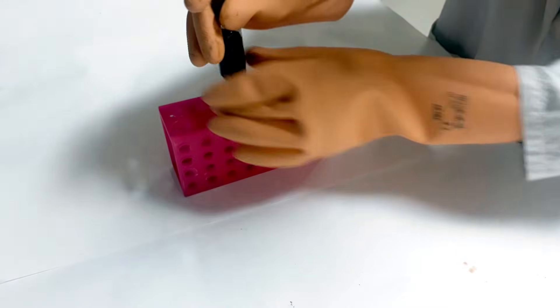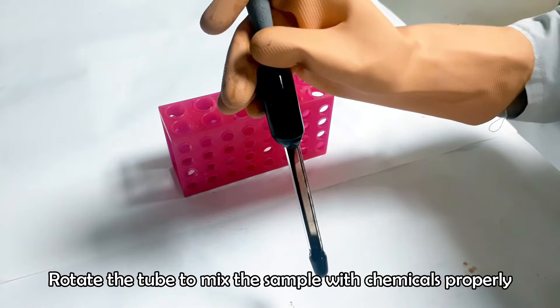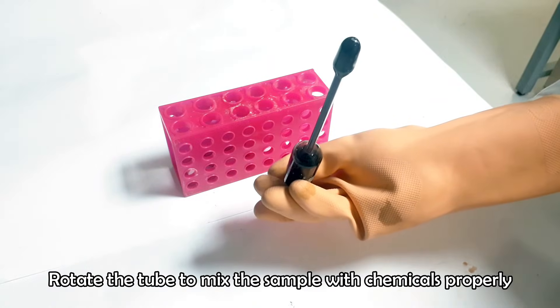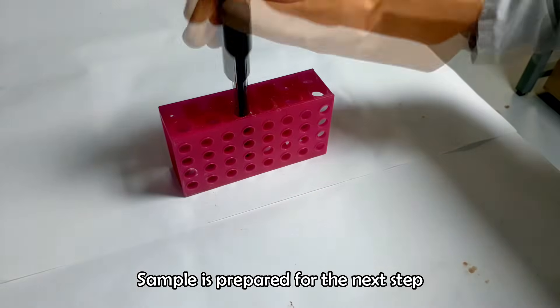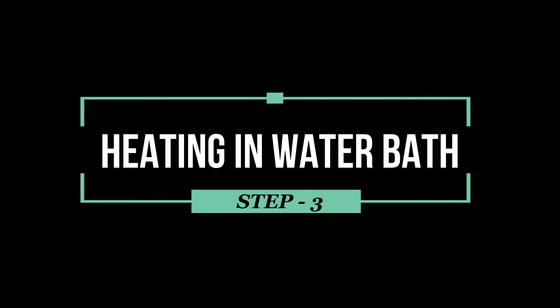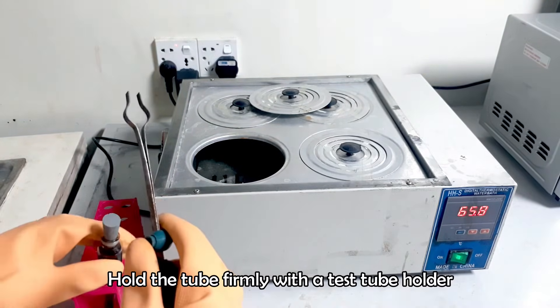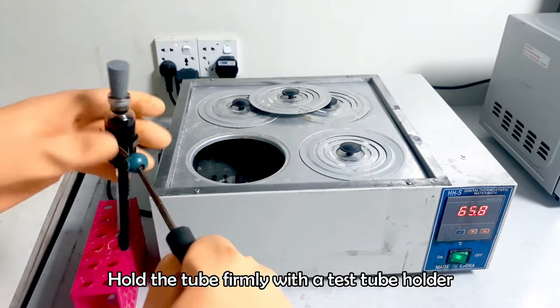Close the tube tightly with its cork and shake the tube very carefully, because extreme heat will be produced during mixing of the sample with acid. Attach a test tube holder to the tube and place it into the water bath to heat at 65 degrees Celsius for 5 minutes.